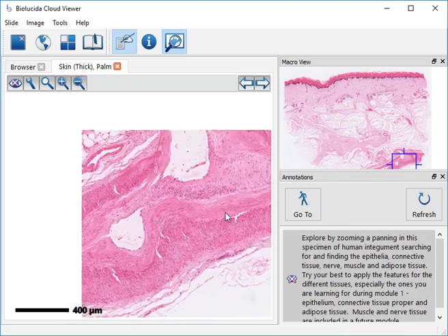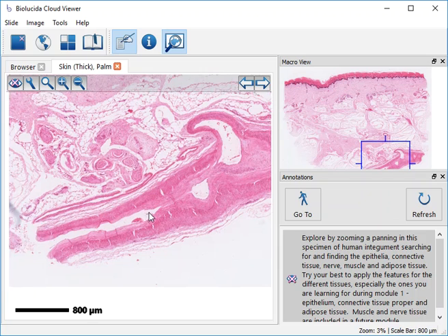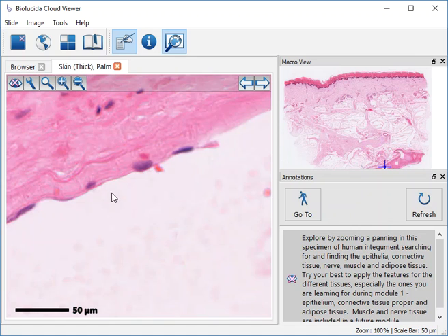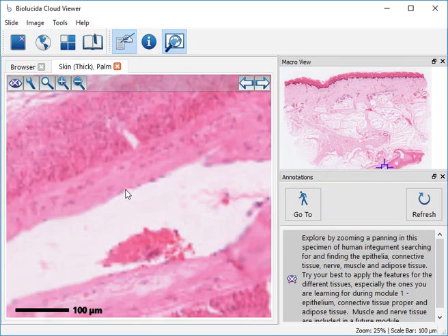And way down here we have an artery with a branch. We're not studying that right now, but you can look at the lining of the artery, which are very flat cells with flat nuclei. Those are simple squamous epithelial cells.